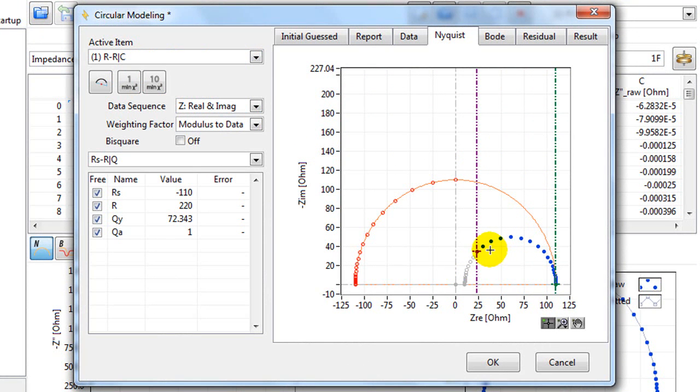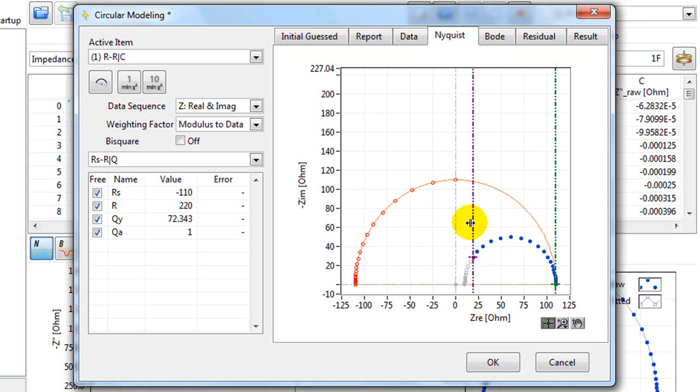The software will use the blue points to do the circular fitting and it will ignore these grey points. I can drag the violet line to the left.